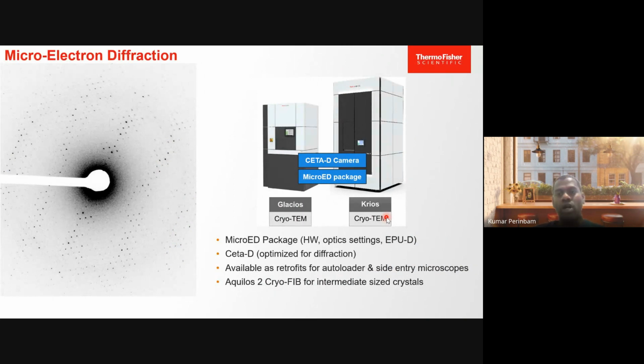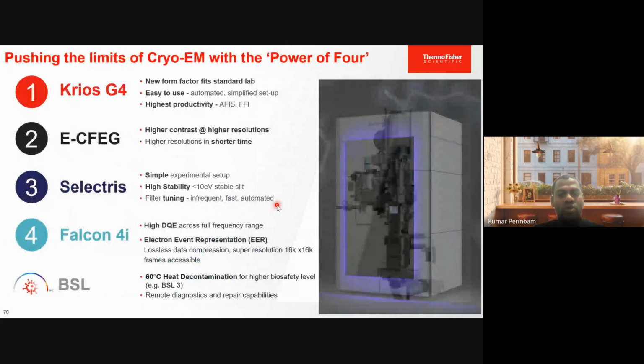So you get one tool which satisfies the usage of fluorescent microscopy and structural biology, cryo-electron microscopy, or replaces tools like X-ray crystallography or NMR, and it supports everything in one tool. You get it. So these are the tools.